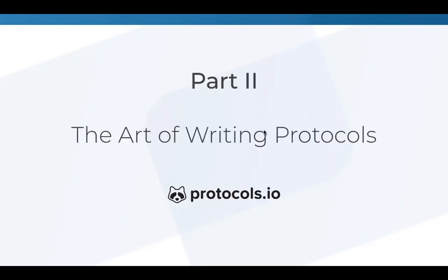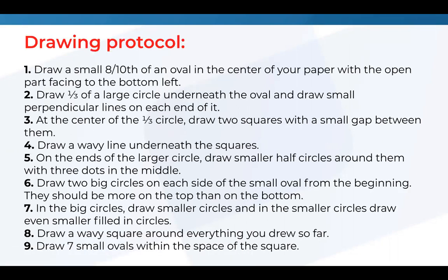So for our next part, the art of writing protocols, if you have a paper and a pen out, maybe we can give it 2 or 3 minutes. If you would like to follow this drawing protocol, we can do a little test.